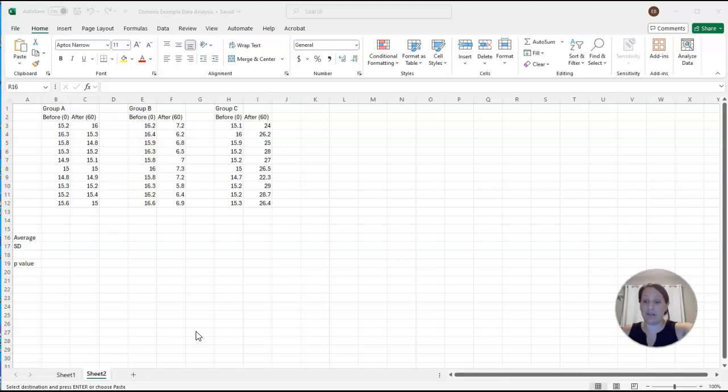During that 60 minutes, you can really start your lab report. Make sure you either bring your computer from home, or there are 4 computers in the lab, 1 per group. You can start to look up reference articles, primary literature, and you can even start to build your own lab report. At the end of 60 minutes, you're going to pull the cells out of their corresponding beakers and pat them dry with a paper towel, and then you're going to reweigh your cells. That will be the weight of your cells at 60 minutes.